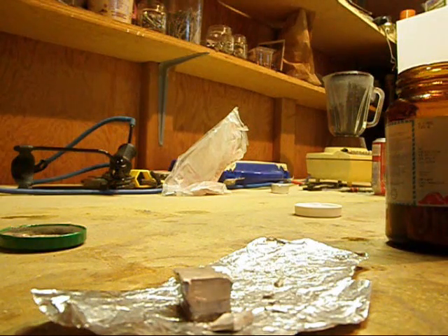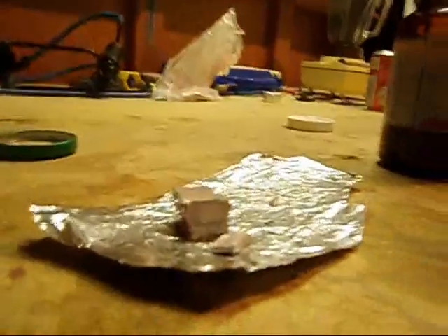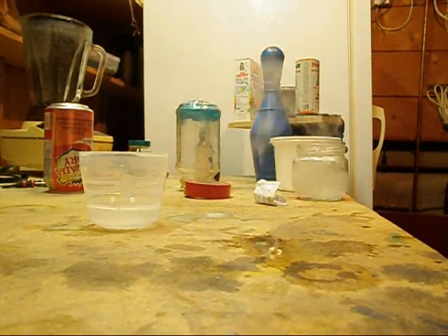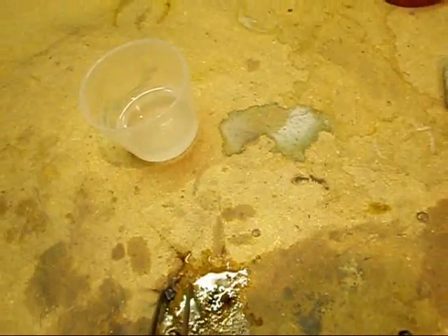When working with sodium, it's important to have eye and hand protection. We're going to put some sodium on this puddle and try to get it to ignite. As you can see, sodium is very reactive with water, and the reaction produces enough heat to actually ignite the sodium.